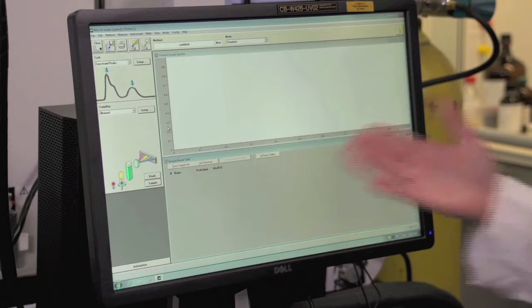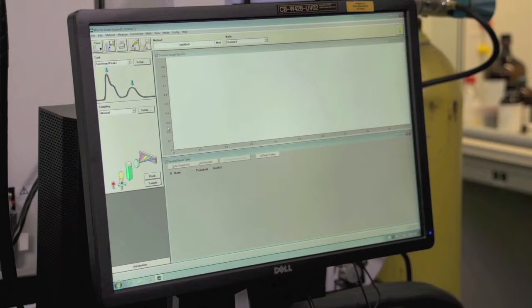Now we have the method is untitled and the mode is standard, and then the task is spectrum peaks, and sampling is manual. Now that our software is set up properly, we're ready to collect the blank. To collect the blank spectrum, select the blank button on the computer and the spectrum will be collected.